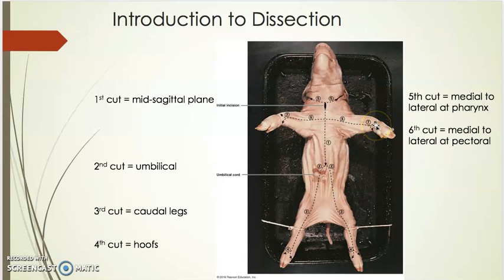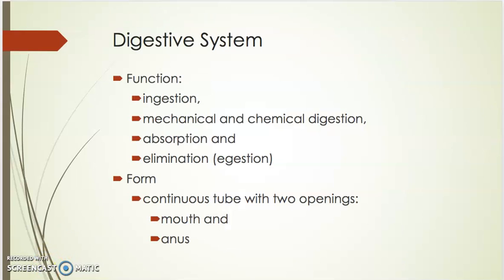You don't start distal and work proximal. You always start at midline with your cuts because that's the more stable area to work from, right? So I want you to get used to the midline as being the most stable part of the animal. That's where you cut from. All in the technique. For the digestive tract, you should know these words.